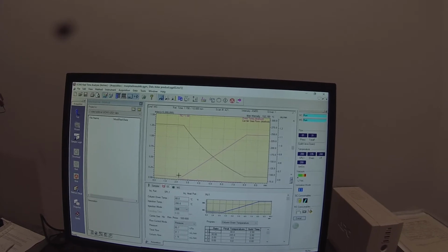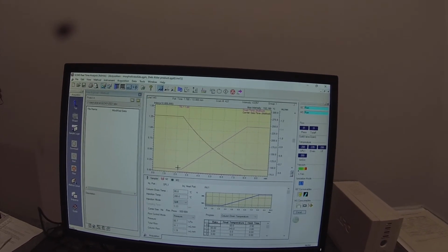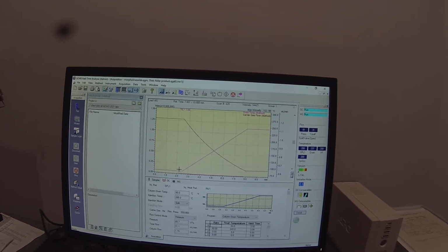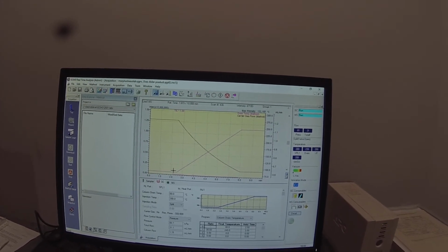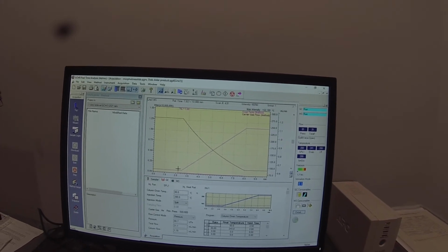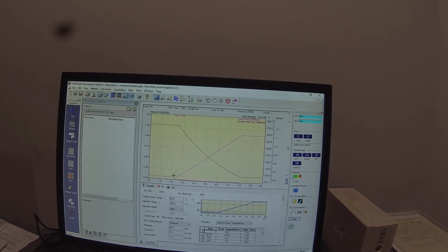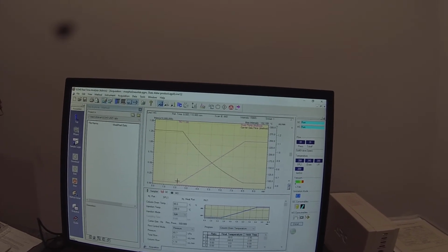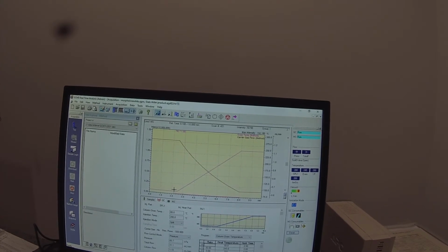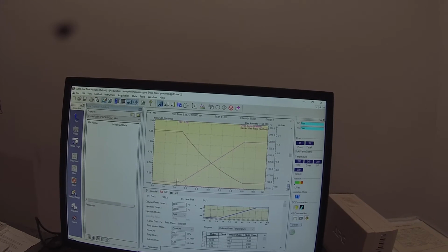On the bright side, we've seen nothing over those first 8 minutes, and it's likely that both the N-phenylmaleimide and the cyclohexadiene would have come off already. So it appears that we probably don't have any of the starting materials. And now we've hit that maximum temperature of 245. And we've got 2 minutes. Hopefully the product comes off.